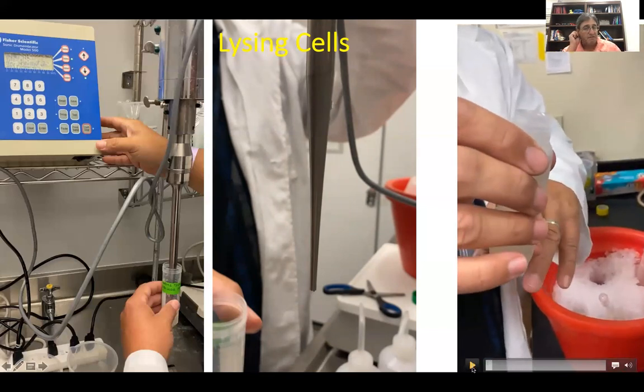So now in this case, I've centrifuged that lysate at a high rate, not the same 3,500 times G, much higher. Look at your protocol and see what your instructor has for the appropriate tubes and centrifuges. After centrifugation, you need to be very careful in how you separate out your pellet from your lysate. You want to minimize the amount of pellet that disturbs back into that lysate. You want a very clear, not cloudy solution. Clear meaning not colored, but that there's no particulate matter in there. Otherwise, it'll get in the way of the purification.